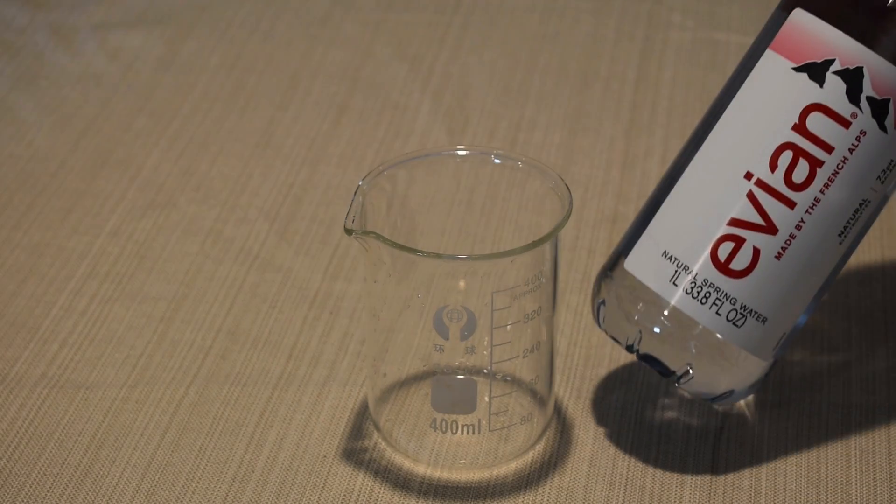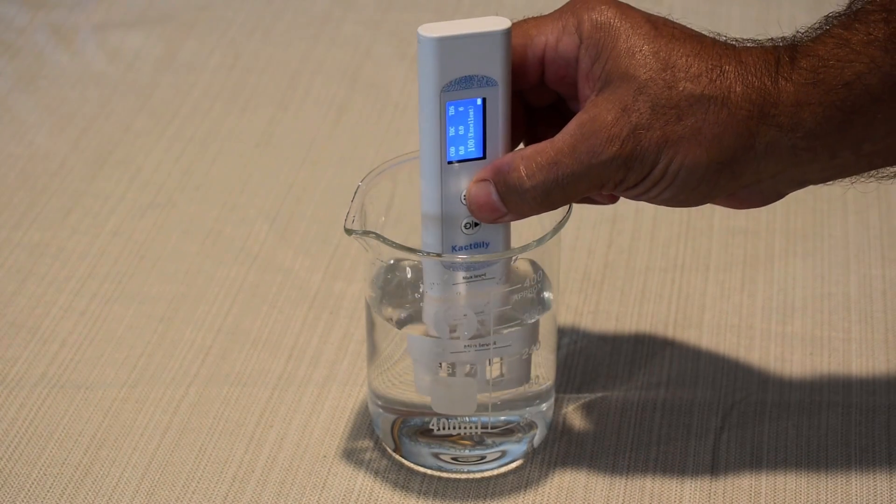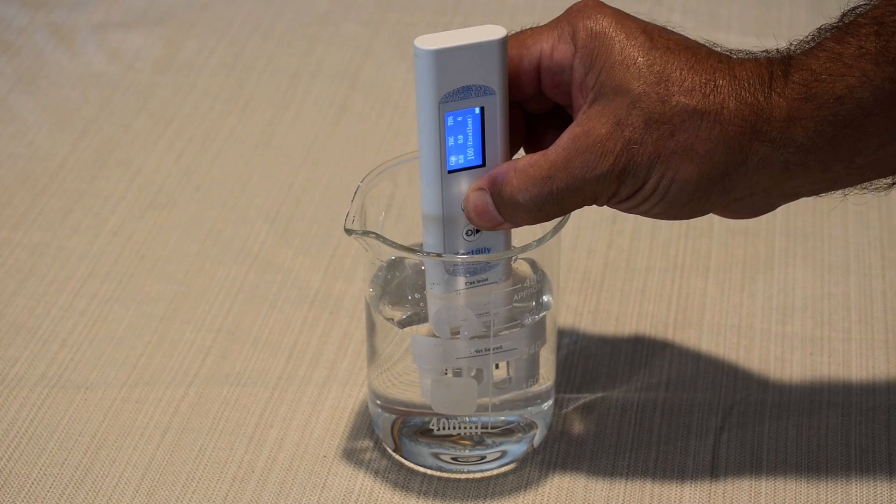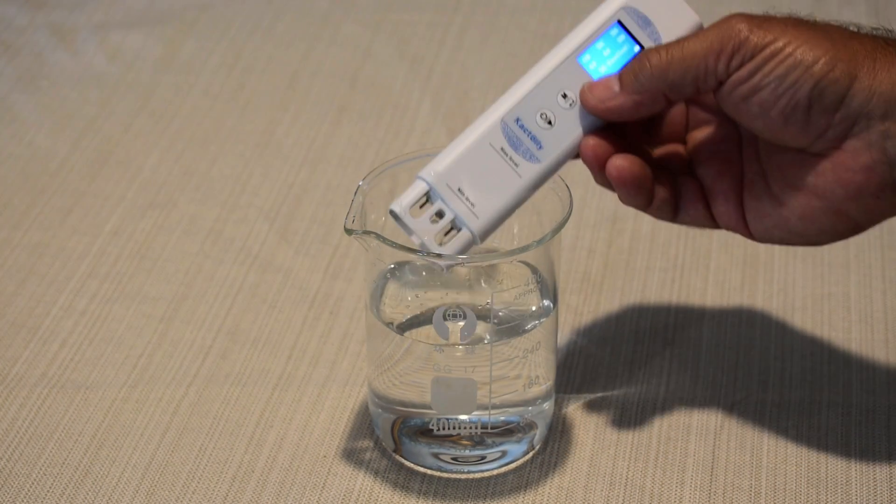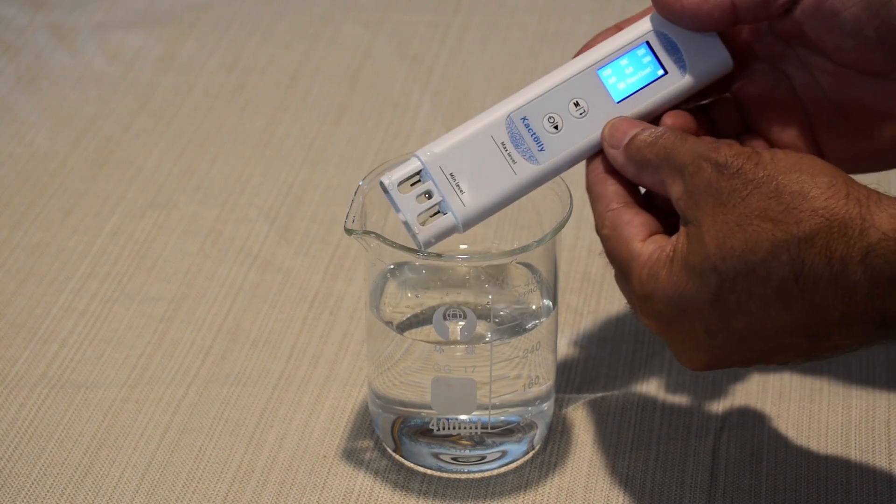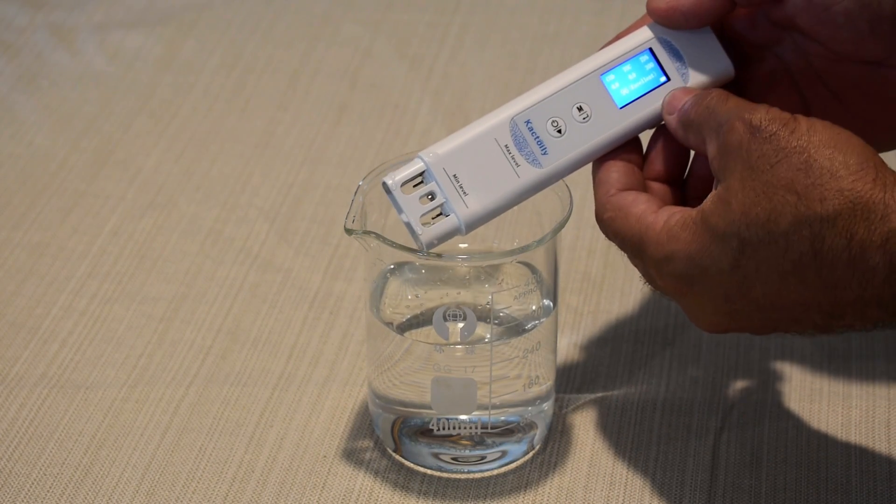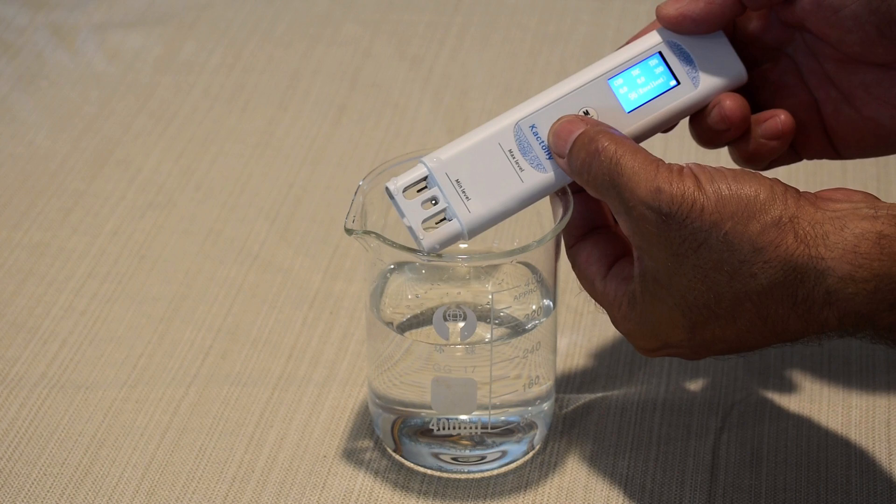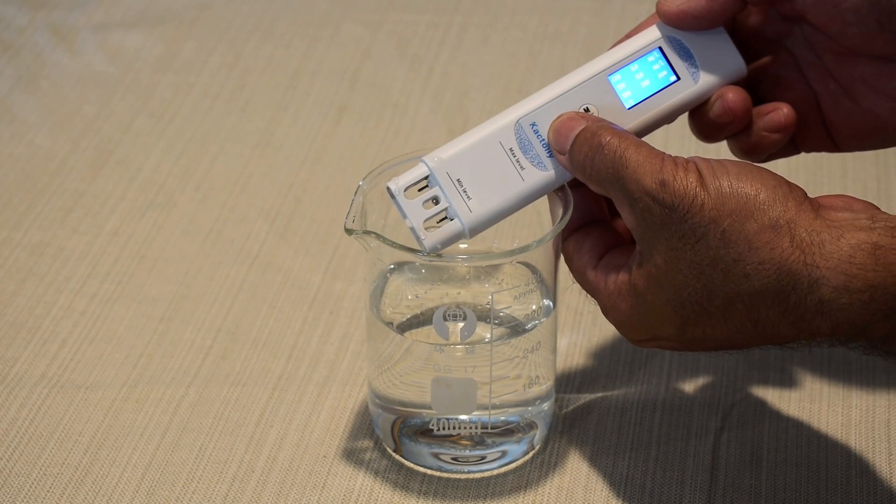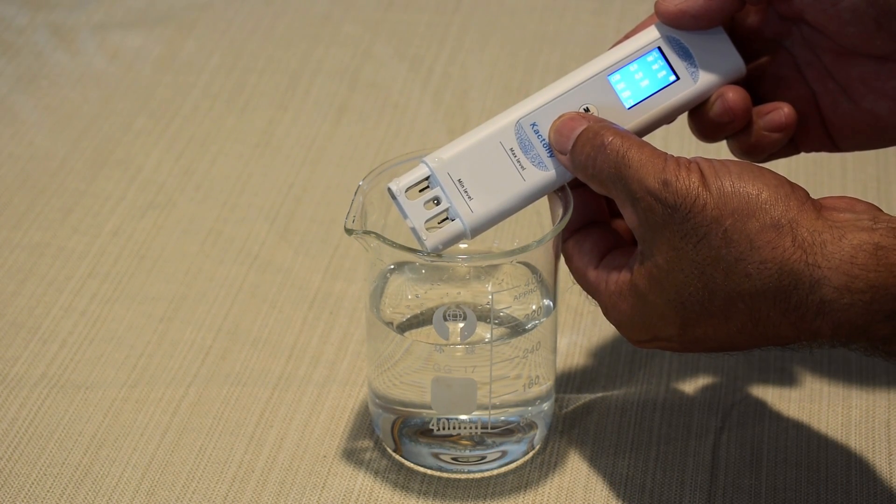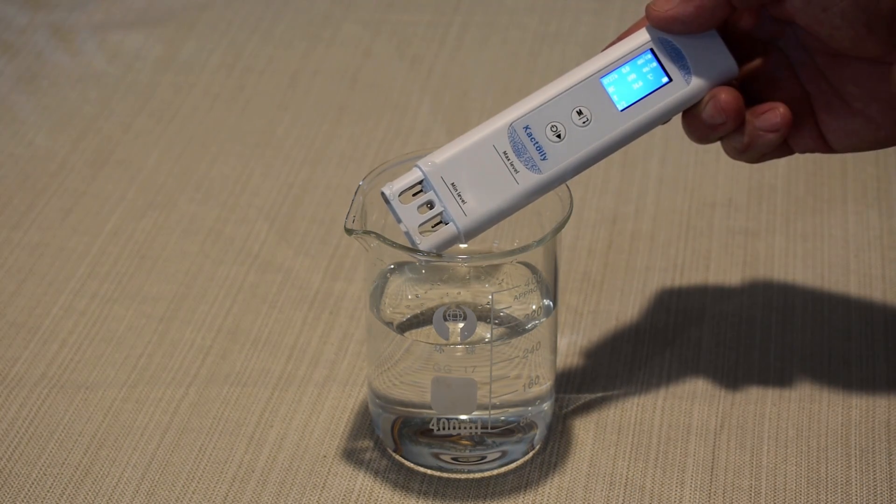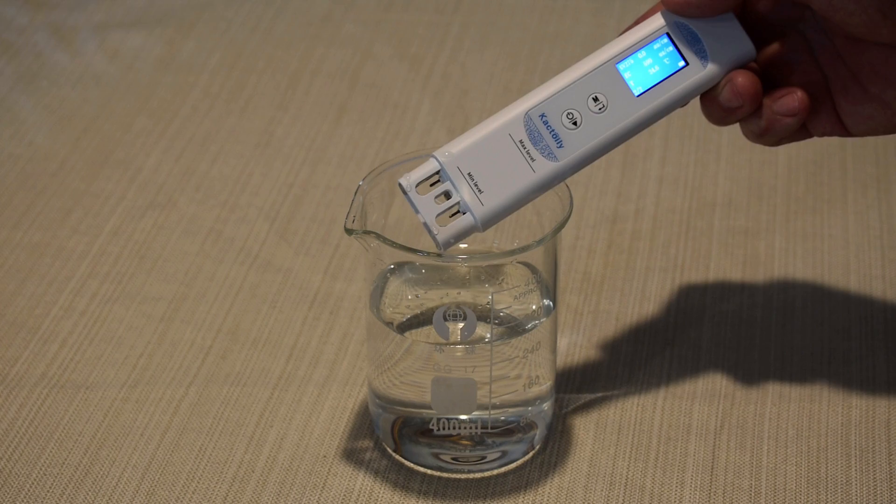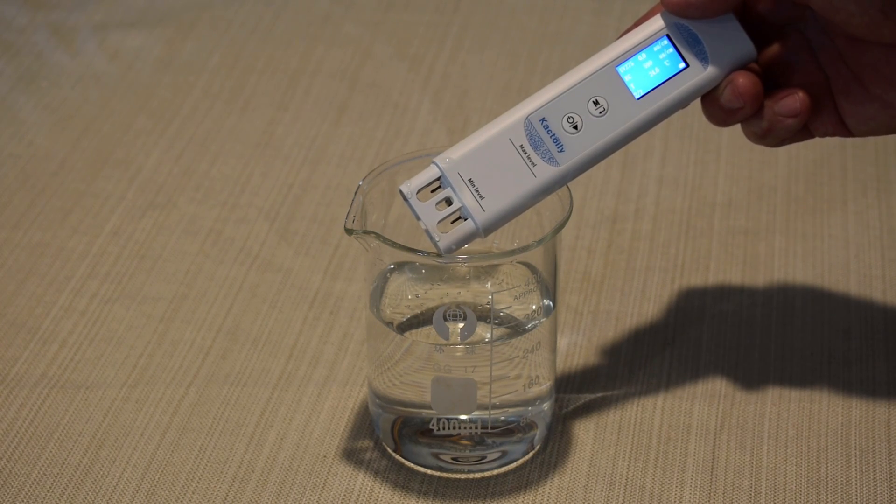Now Evian. All right. 96, excellent. TDS 300. COD, TOC are all zero. UV-275, that's zero. Electrical conductivity is right under 600.